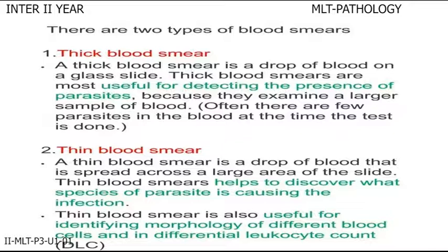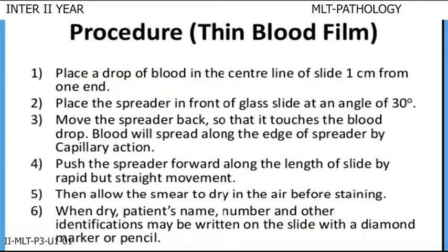Thin blood smear is a drop of blood placed in the center line of the slide, 1 cm from one end. Place the spreader in front of the glass slide at an angle of 30 degrees. Move the spreader back so that it touches the blood drop; blood will spread along the edge of the spreader by capillary action. Push the spreader forward along the length of the slide by a rapid but straight movement. Then allow the smear to dry in the air before staining.